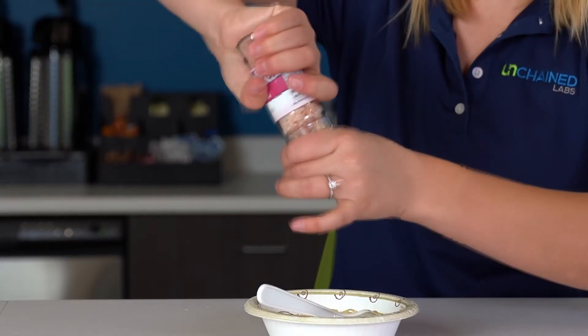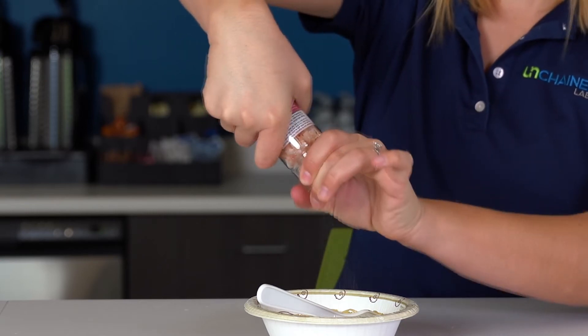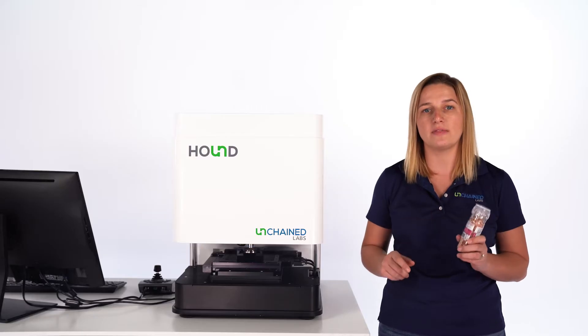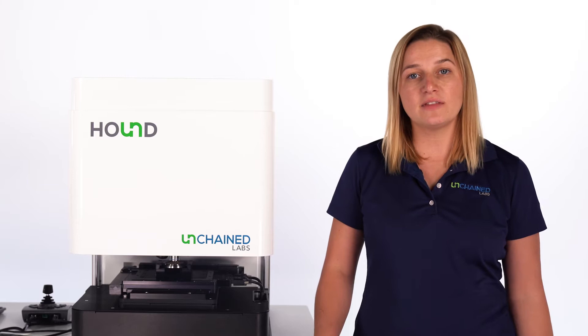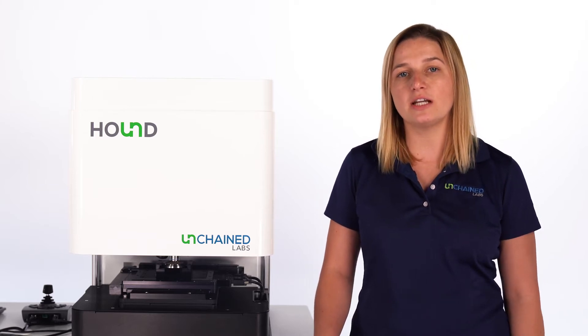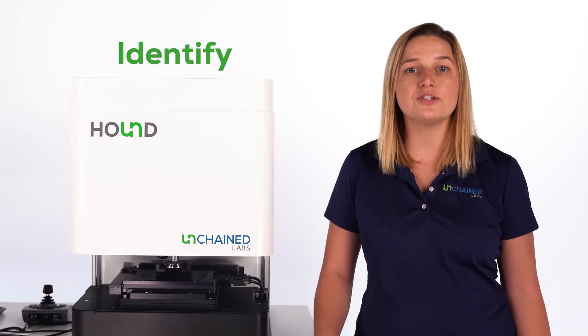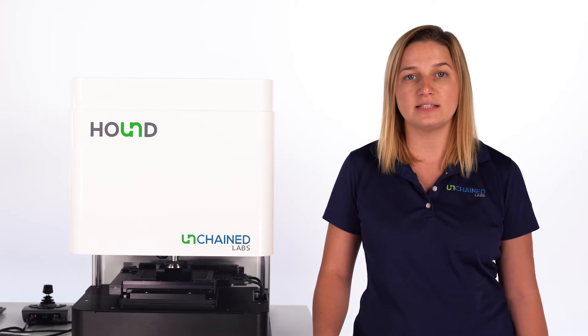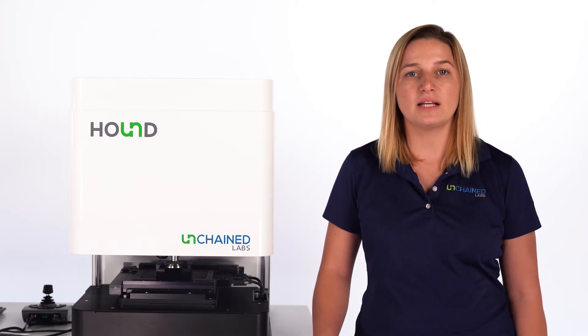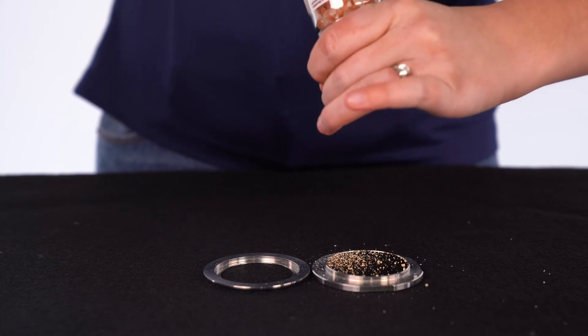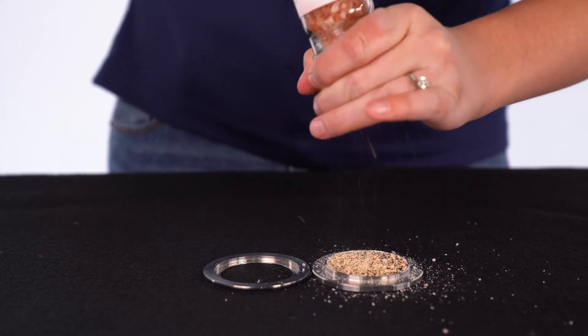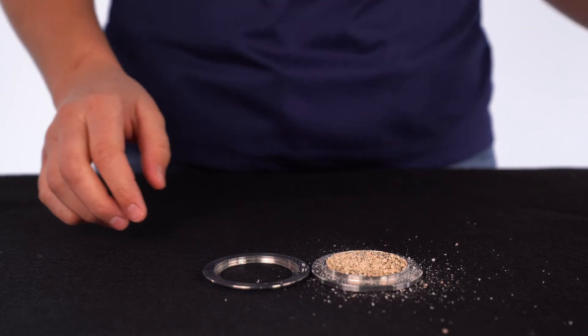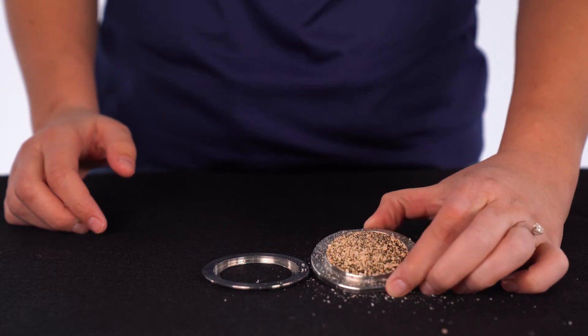Because of this, I'm specifically looking to count, identify, and track down the source of any plastics that we find mixed in with our salt. Let's test this out by grinding some salt onto this gold-coated glass slide and popping it into Hound for analysis.